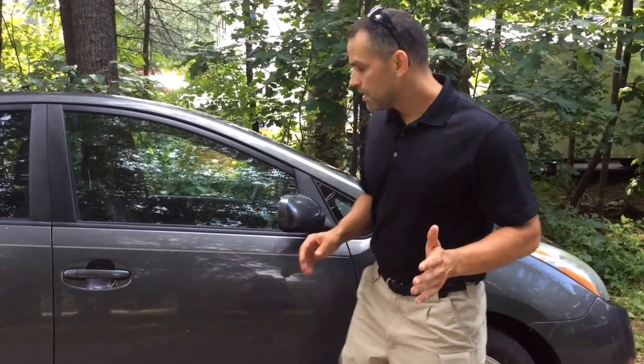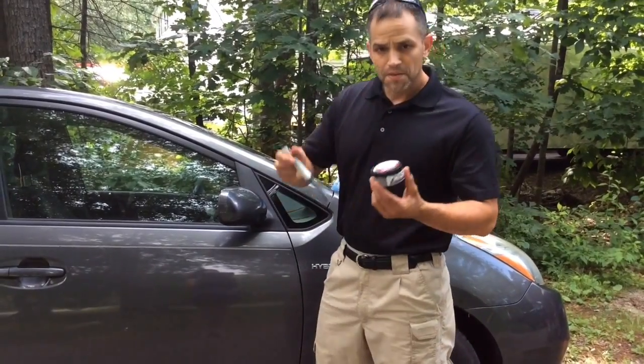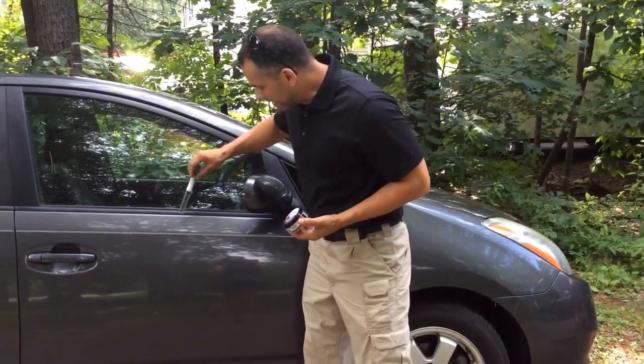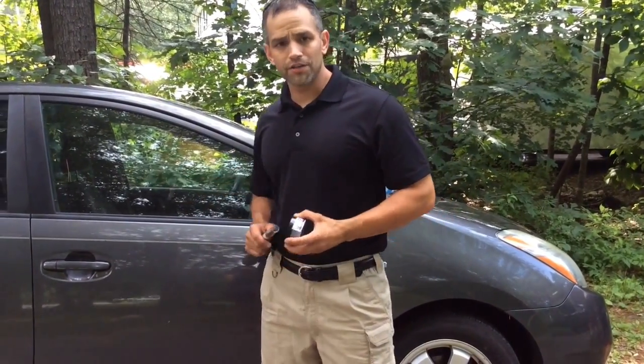Hi, welcome back to Forensic Education. I'm Mike McCutcheon and today we are outside on this beautiful day and I'm going to show you how to process a car in just a few seconds. Now if we had fingerprints on the outside of our car, we would use our traditional powder and our brush and would be brushing along, but that would take all day. So I'm going to show you how to process this car in just a few minutes.